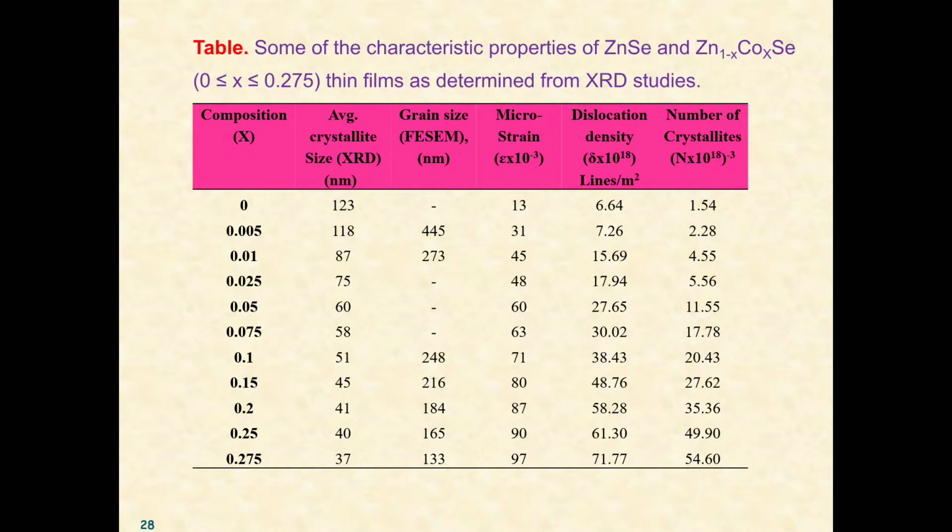So this is the table of characteristic properties of ZnSe and ZnCoSe thin films as determined from XRD studies.